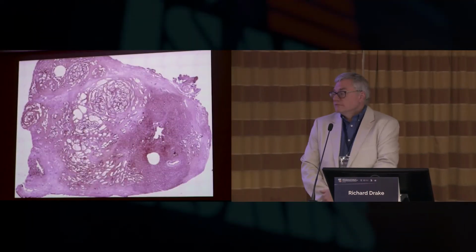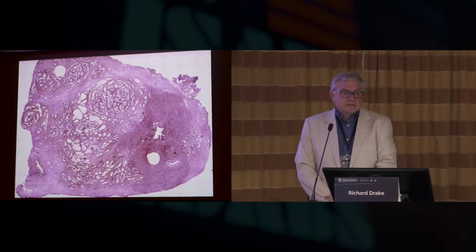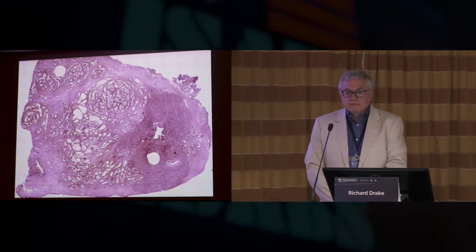A lot of the methods we developed were to capitalize on being able to look at formalin-fixed paraffin-embedded tissues. They're stored worldwide. There's millions of them out there. And if we're going to look at disease, particularly cancer, changes in cancer glycosylation, these would be the best kind of tissues you could start with if you could make it work.